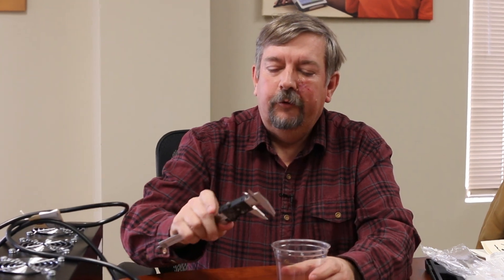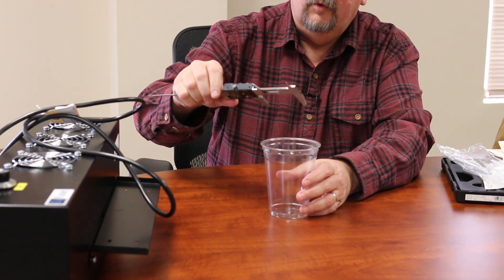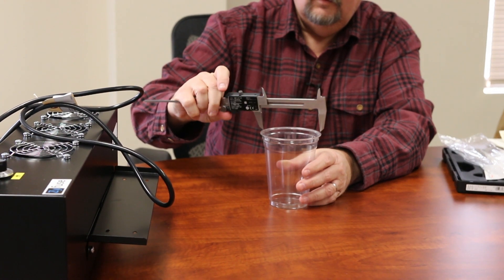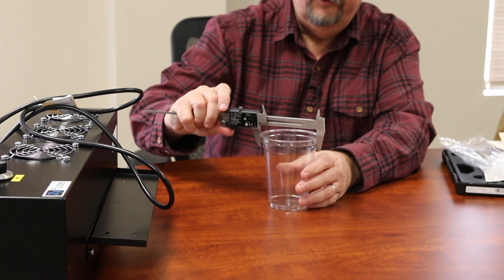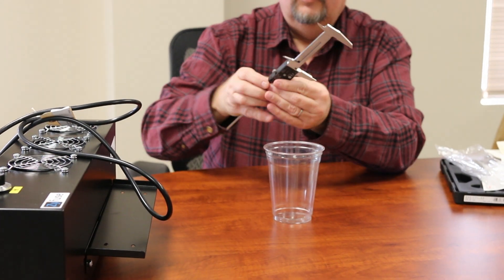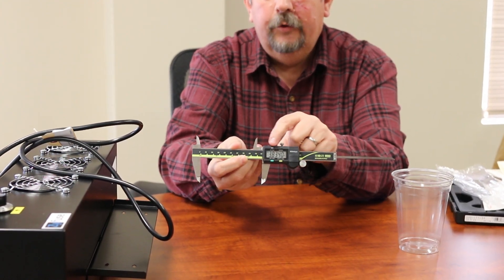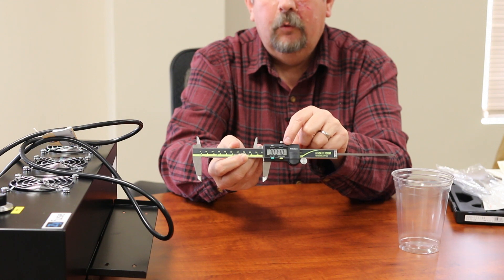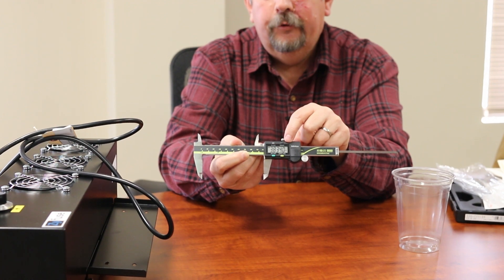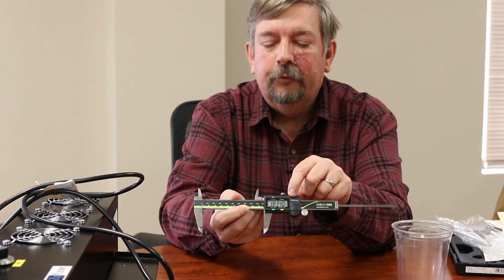So how it works is just like any other caliper. I can come along here on this cup and open it up with the thumb screw until I feel just the pressure of the outside rim of this cup, and then I can turn it around to the camera and show the dimension right here. This actual caliper will register it in terms of inches or metric. So there is the dimension — it's like 3.8 and change inches on this particular object.